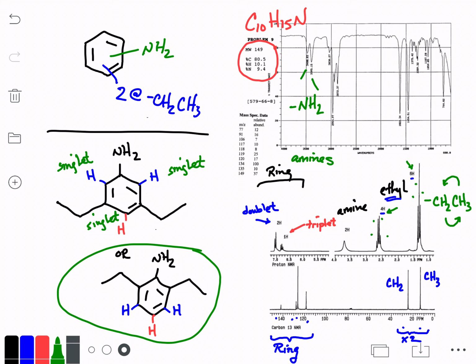You'll be looking at the IR spectrum to determine which parts of the molecule you have, how those atoms are used. Do I have carbonyl groups? Do I have amines? Do I have alcohols? Whatever it might be. You look at the carbon NMR to find out about symmetry, sort of gross structural features, and then use the proton NMR to really drive home which one of the molecules is true. I'll have lots of practice at this, but I hope this walkthrough helped.